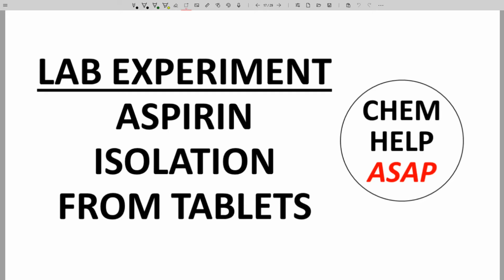In this video, we will isolate aspirin, O-acetylsalicylic acid, from aspirin tablets. This is a classic experiment that students do in either high school or college. We will do this experiment with a more college-level view of the process and discussion of how the properties of aspirin affect the isolation process. The video description contains links to supporting documents, including the laboratory procedure and proton NMR spectra.